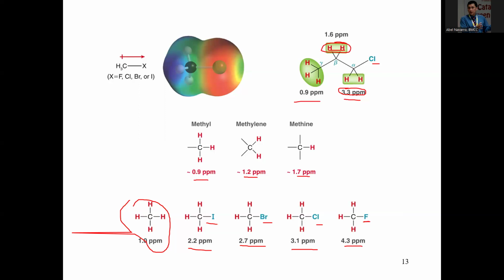Like how many hydrogens are present in the carbon, but they are very close. I mean, even though it looks like 0.9, 1.7, oh, that's a lot. That's almost twice. Yeah, but it's really not. You think that the ppms go from 0 up to 12, okay?